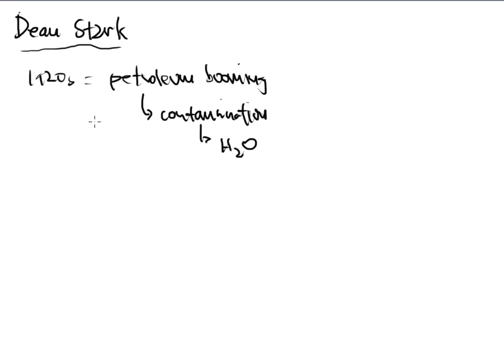Now, the problem here is that a lot of people said, well, we'll just heat it. Right? If we heat it, then all of the petroleum could maybe distill over and we could capture the petroleum, and maybe we could separate the boiling point of water out and collect the water and remove it, and then just continue to heat the sample from that point to get all of the higher boiling point petroleum compounds as well. Well, here's the problem. If you heat it, this does not work. And the reason is because the problem is with emulsions.